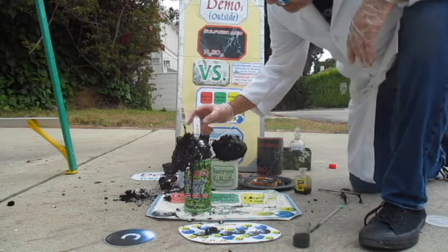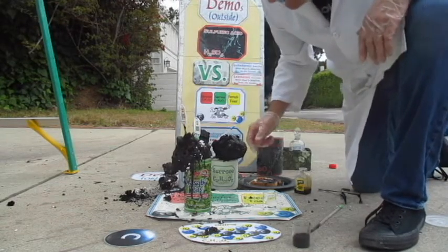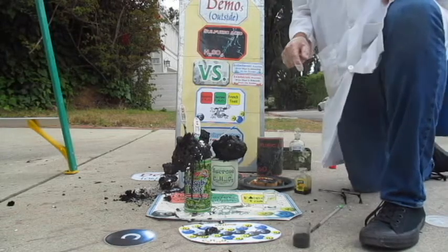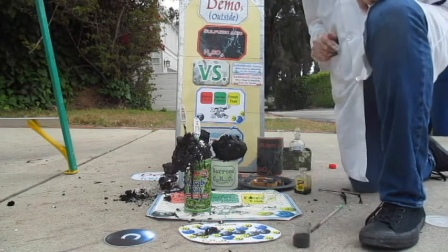And if you're wondering what that would be in Fahrenheit, let's switch this over to Fahrenheit. And that is, oh yeah, 300. It's just getting to 300 Fahrenheit. So it doesn't sound as hot in Celsius, but that's a really high temperature.